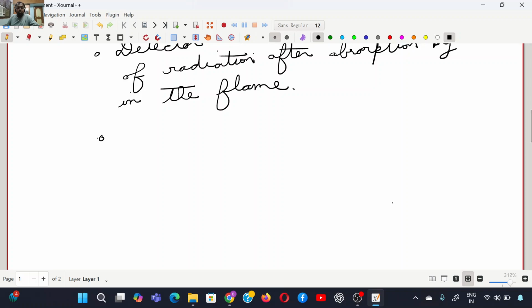Finally, we have amplifier and readout. So from the name, you can guess what they do. What does amplifier mean? So basically, it amplifies the signal, right? You know amplitude, right? So yeah, it basically amplifies the signal, which is displayed as an output. And readout means you are reading the output. So this allows quantitative analysis of the element's concentration.